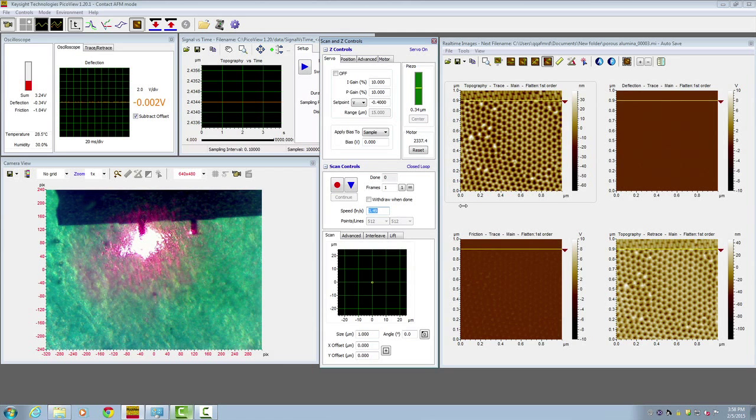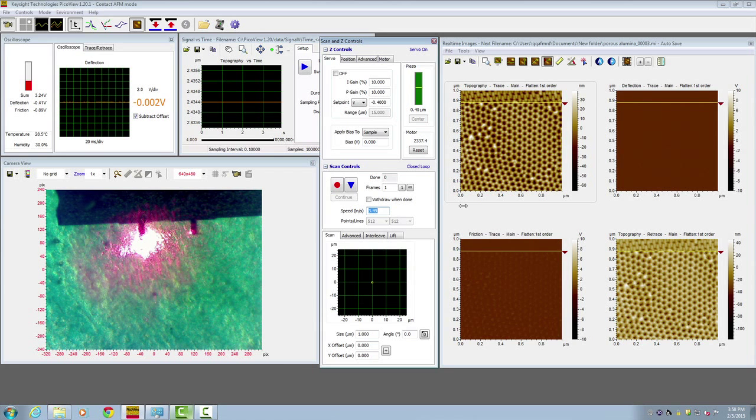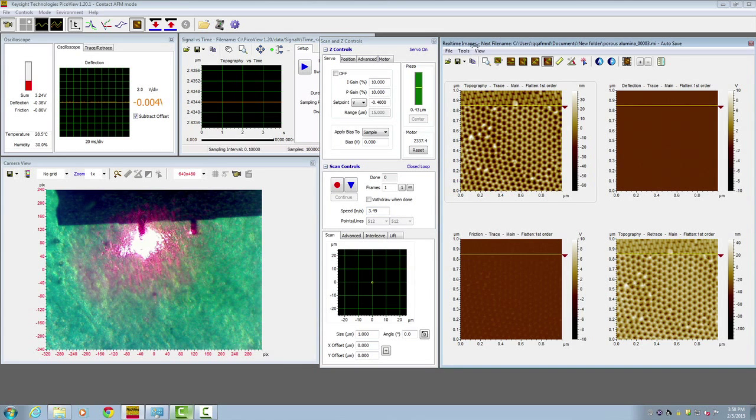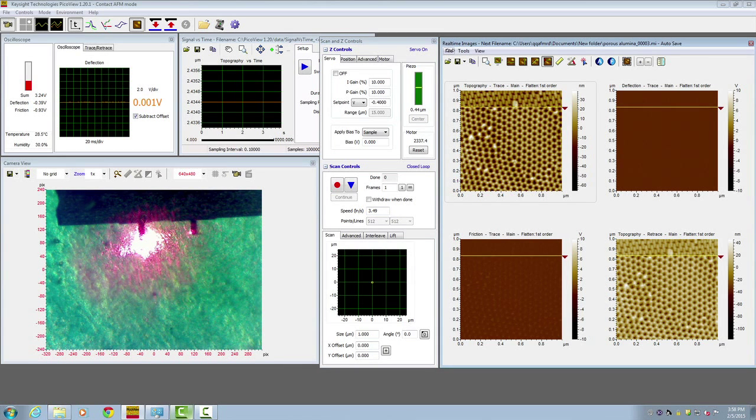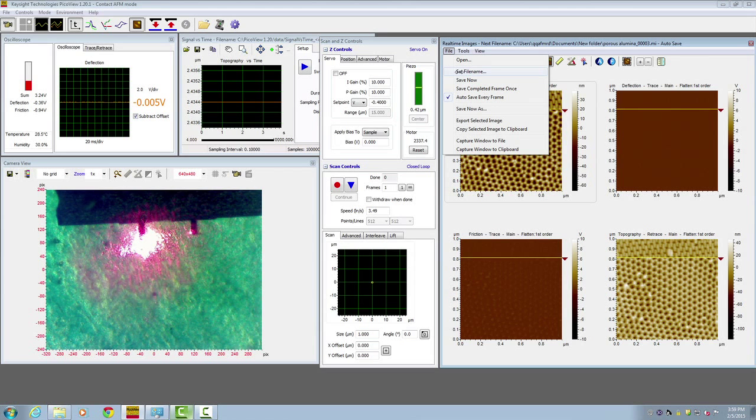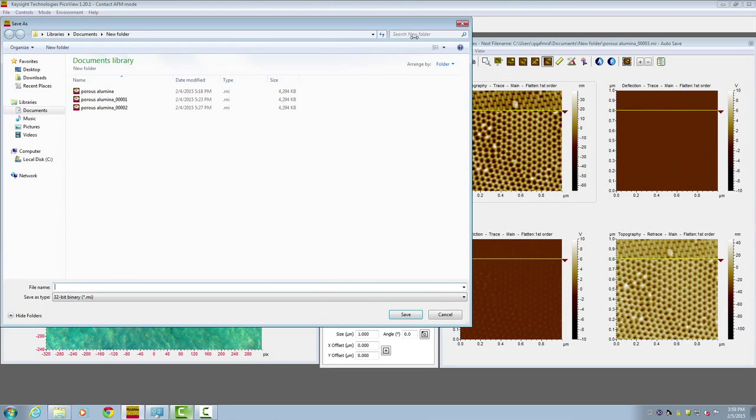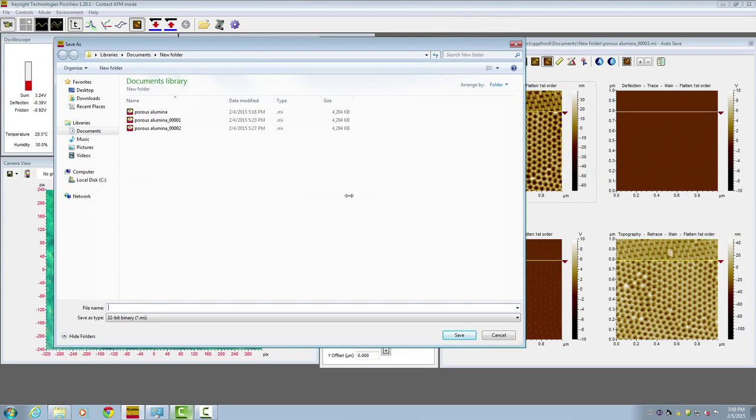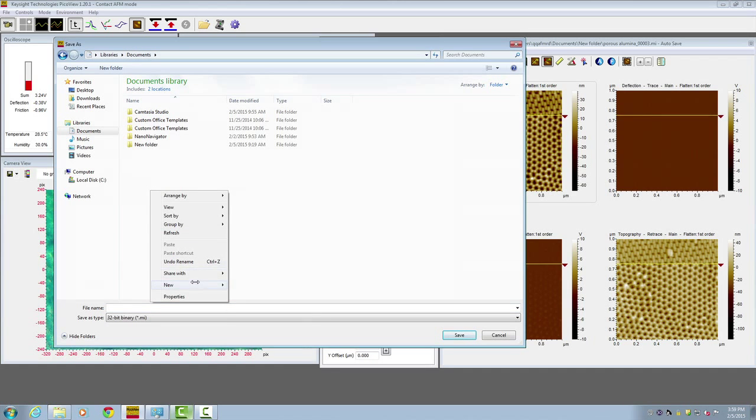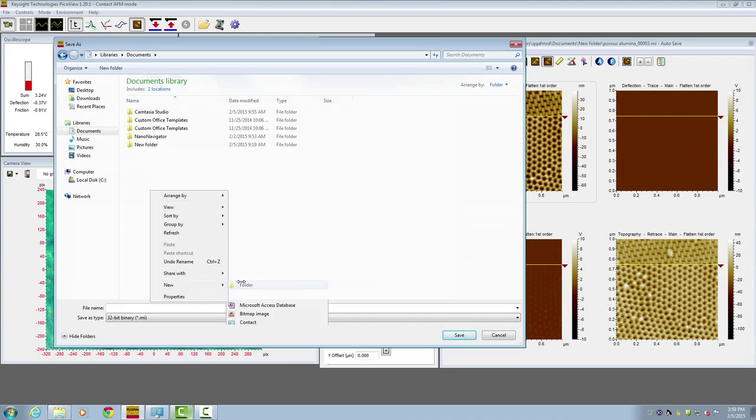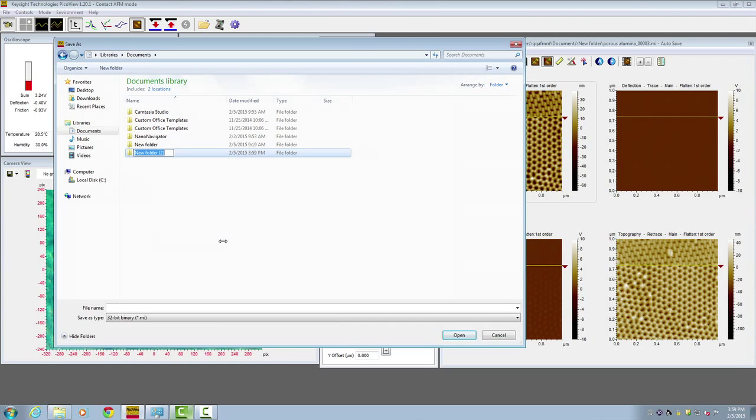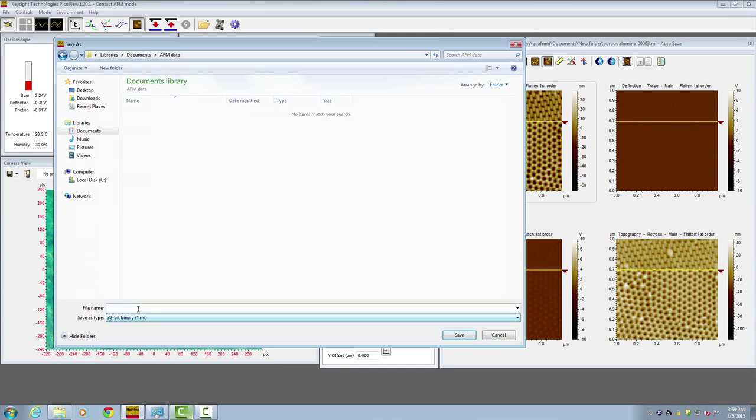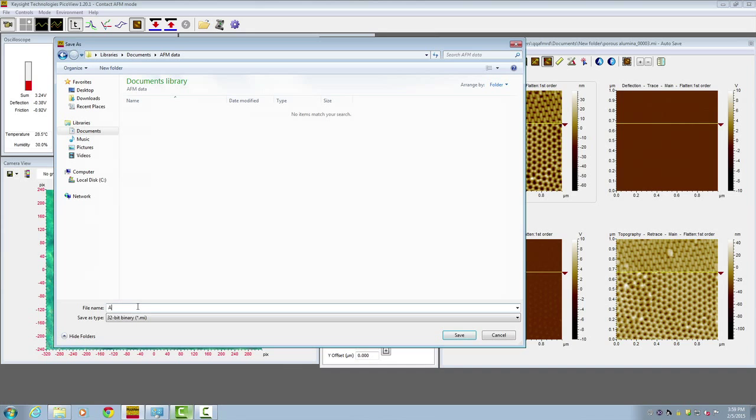Now, in order to save your file, you need to set the file name. Go to the real-time image window, open the pull-down menu of File, and click on Set File Name. Here you can make a new folder, AFM data, and put a file name. Here it's Eliminer. Click save.